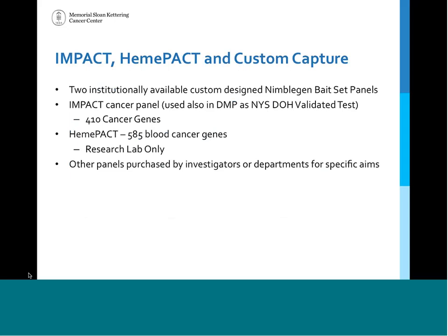Then we also have a panel designed for liquid tumors called HemePACT, and this is 585 commonly mutated blood cancer genes. This panel is only available in the research lab currently. There are plans to very soon implement this in the clinical lab as well. And then we have other capture panels that are purchased by investigators or departments to cover specific aims.